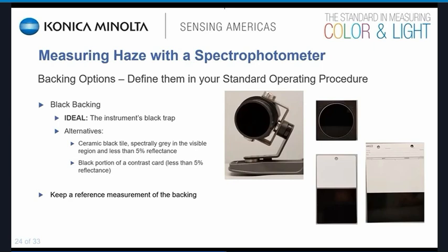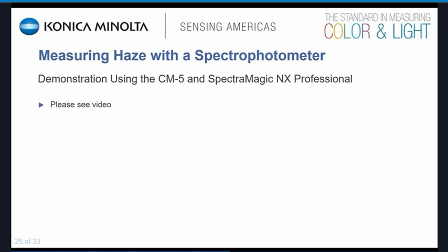And really important is I recommend you keep a measurement of your backing materials that you've chosen, because if for whatever reason later on that you damage your backing material, or if you're using some backing material that goes out of production and you can't acquire it anymore, you'll want to be able to replace it with something that has very similar optical properties so that you can correlate your old data to any new data. And now we'll just go through a few demonstration videos.